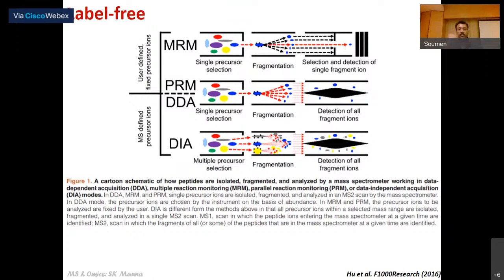However, the problem is that if you want to analyze a set of 1,000 samples, and want to exactly identify the protein expression difference, there are no 1,000 different tags.